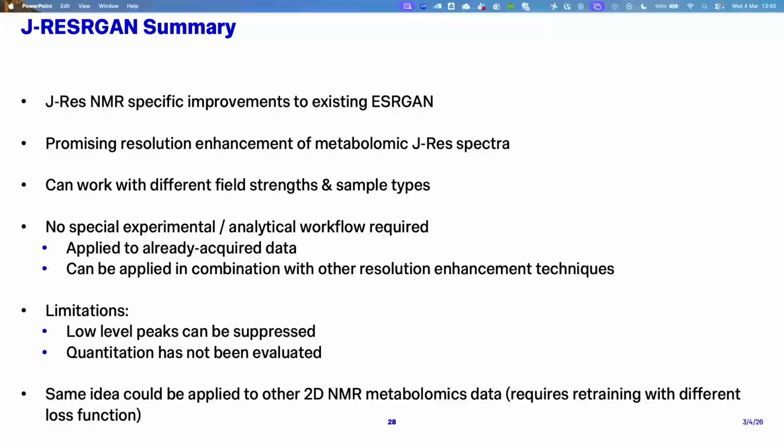Good idea. Why wouldn't that just be done normally, when you're doing your processing? One reason is because of convention. Essentially, the way NMR spectroscopists look at this data, they like to be able to see the symmetry. Another aspect is that it's like quality control of the data, I suppose. If there are any areas which are not symmetric, you know that they are probably artifacts. In theory, you could fold those over once you've done all that quality control, and you could probably look at that. But it's the way that NMR spectroscopists always view their data, with this symmetry in there. Perhaps Itamar or one of the other NMR people can add to that.